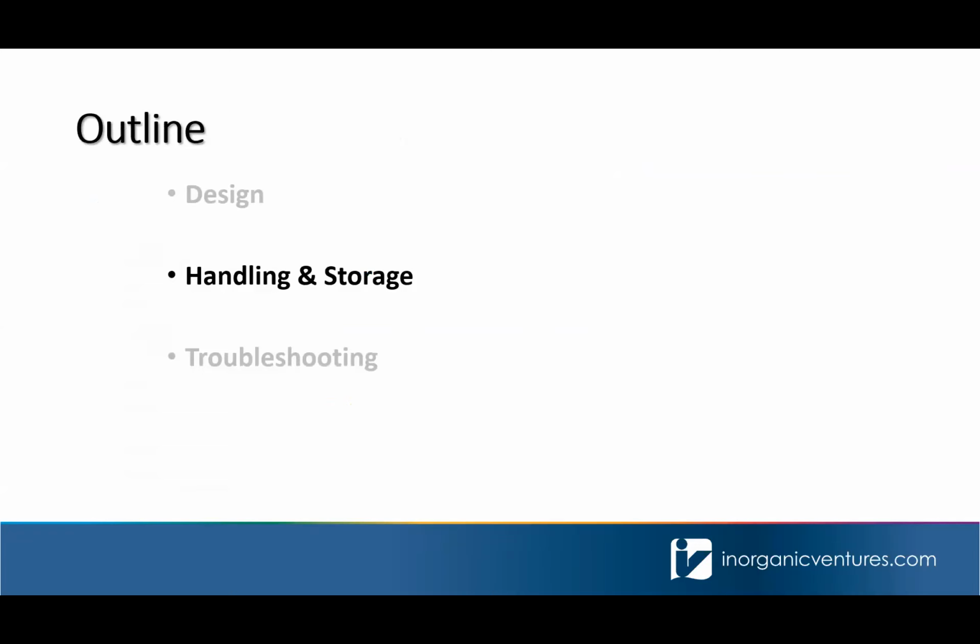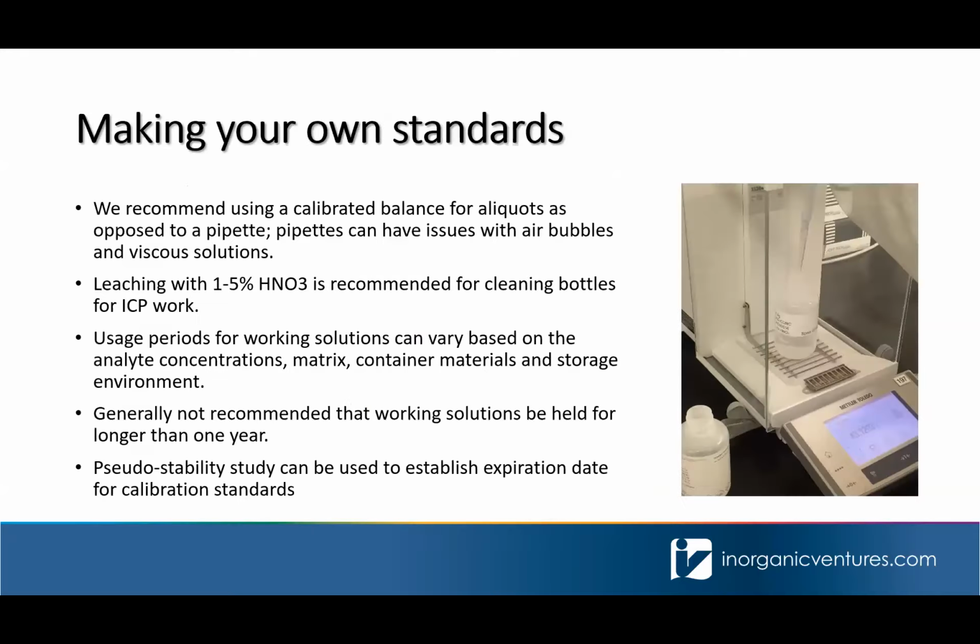In this section, we're going to discuss the proper ways to handle, store, and prepare your working solutions. First off, let's talk about the actual design or the creation of your own standards. As I mentioned earlier, the majority of our customers will create working solutions from our products in some form or fashion. In general, what we recommend is a gravimetric preparation, and this is what we do in-house also, as opposed to a volumetric preparation.